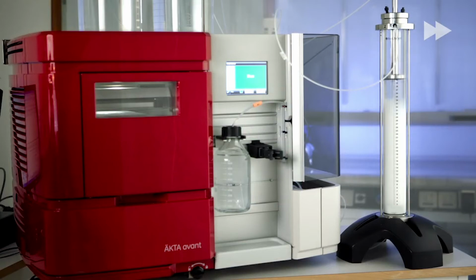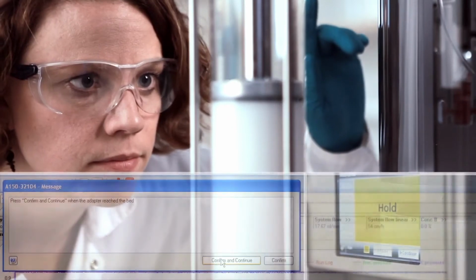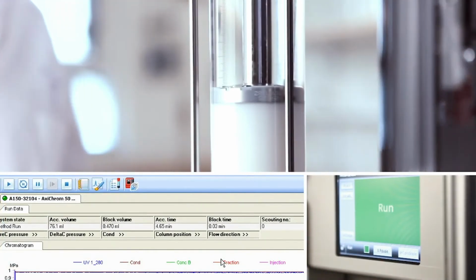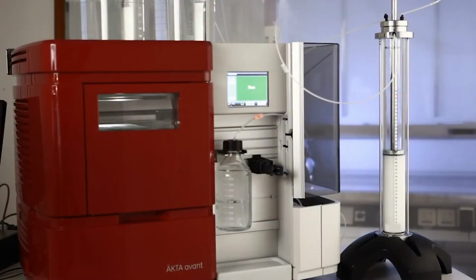The time for the adapter to reach the bed depends on the bed height. These times are in the start notes. When the adapter reaches the consolidated bed, the operator confirms by clicking the Confirm and Continue button on the touchscreen on the system or on the computer screen. Mechanical bed compression begins, and the bed is compressed according to the selected packing factor.